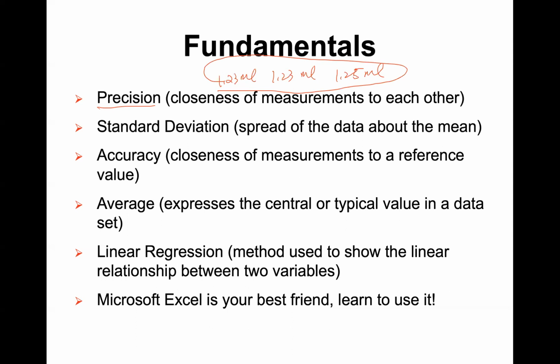But accidentally, if you have a value of 3.12 milliliter, then we will consider this an outlier. So this one we have to discuss if we are focused on the precision. But for our experiment, since the volume is the one we would take to the flask, either volume will be okay because every volume corresponds to a mass. As long as those volume and mass form a very nice linear relationship, they are okay, right?